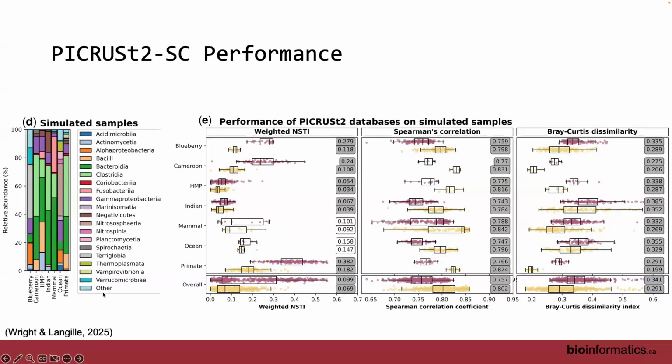Yeah, it's a common technique that you can sometimes use for stacked bar charts because you'll often get back a big list of taxa. Say you have all your different genera, and it's quite common for people to just rank the top 15 or so and then group everything else into other, just because visually you can't see 100 colors on a stacked bar chart. Yeah, yeah.